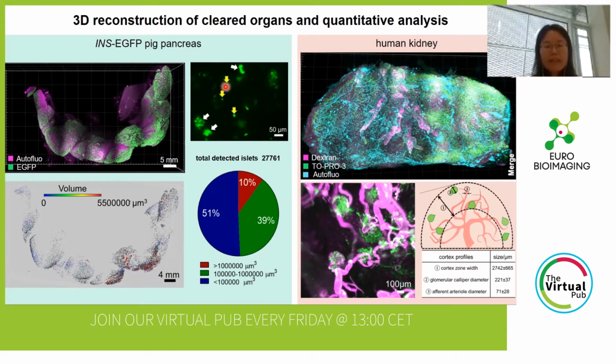And when we zoom inside the image, we can see that the islet could be a single cell or a cluster of cells. Based on the volume of the islets, we can quantify the percentage of islets across the very big volume of the pig pancreas samples. On the right side is an example of the human kidney.